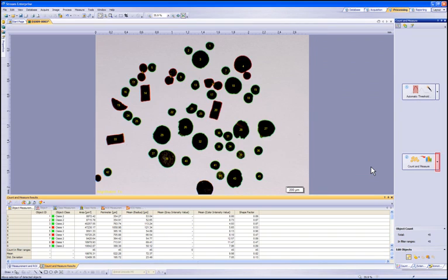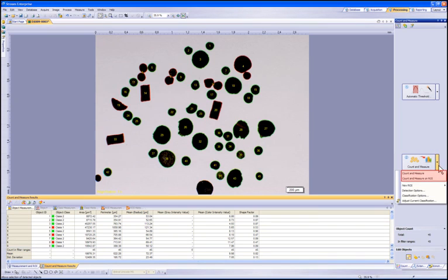Further, there are options for Count and Measure under the drop-down next to button 2. Let's show these and go through them. The first two options allow you to perform Count and Measure on the entire image or region of interest.